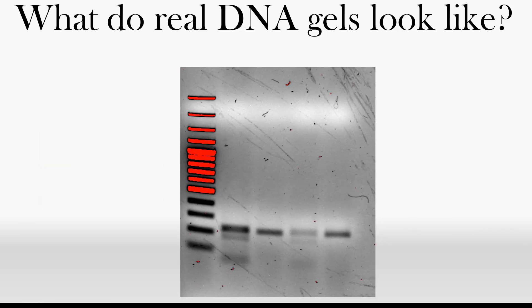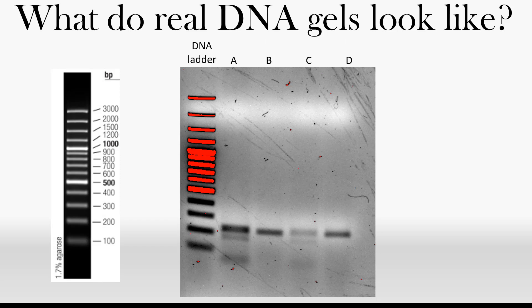Here we have a DNA gel prepared by University of Guelph human genetics students. For this gel, students prepared and analyzed their own DNA. We can see that a ladder was run in the first lane, along with four samples. We can compare the ladder markers to the manufacturer's information sheet to label the ladder and determine the sizes of the DNA fragments in the rest of the samples.